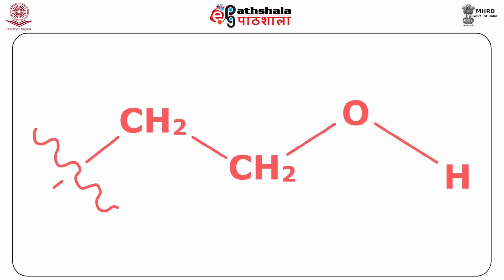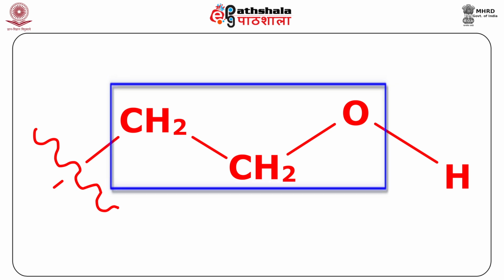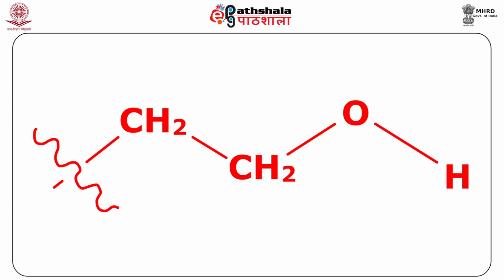Next, remember that the presence of a triplet at 3.9 ppm having 2 protons indicates the presence of a CH2CH2O group functionality, because you can only observe a triplet if the next carbon has 2 hydrogens. Remember that a peak at around 3.5 to 4.3 ppm is typical of an OCH functionality as it is downfield.